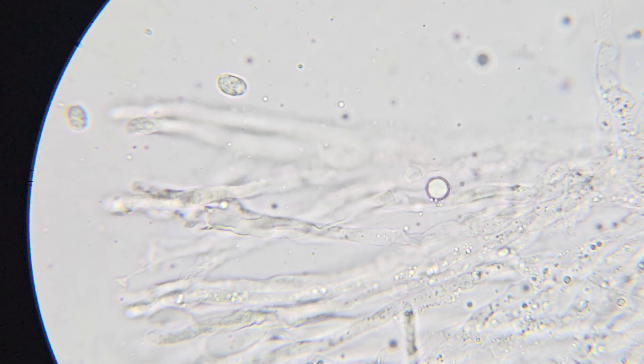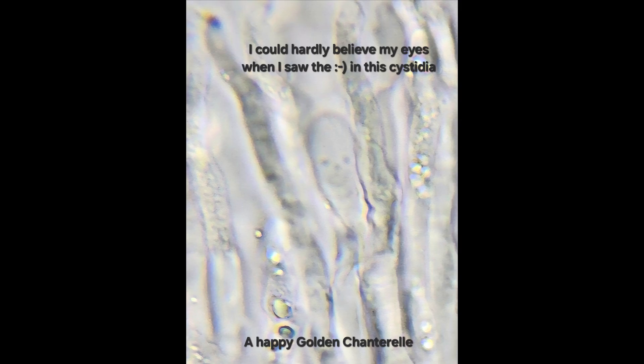On this next picture I was surprised to see the smiley face — can you believe that? Look at that. That's an actual picture; I did not doctor that or anything. That's just maybe bacteria or something within the cell wall of that particular cell, and it clearly looks like a smiley face. So I guess that was a happy chanterelle — that was pretty cool.